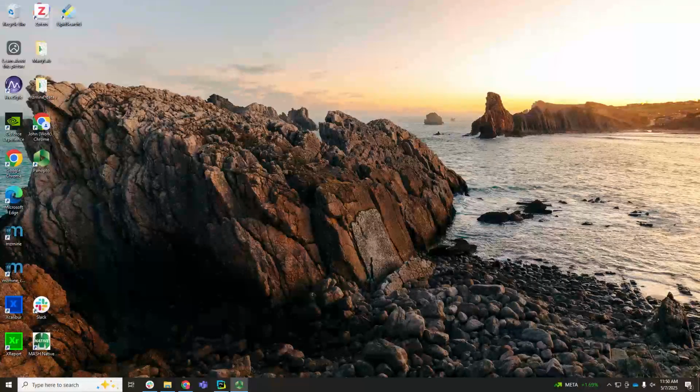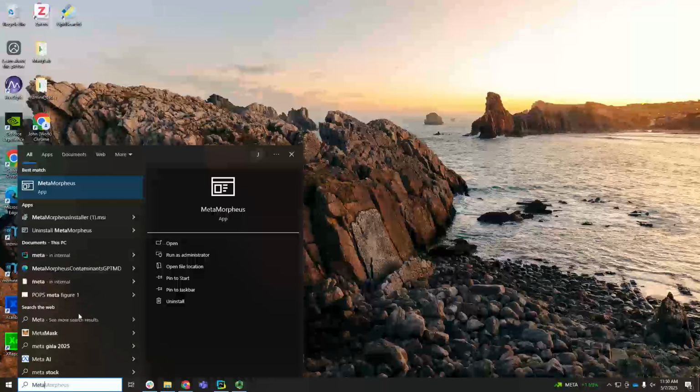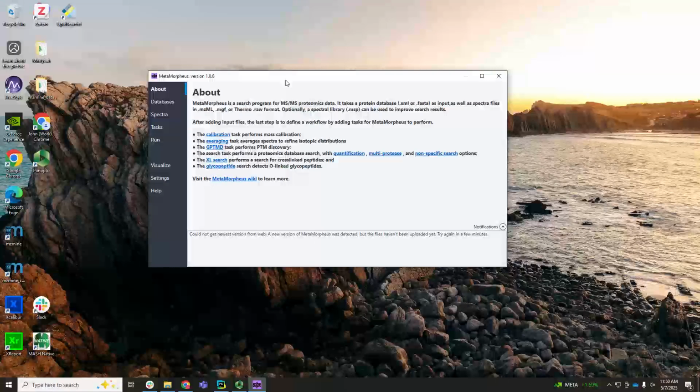I'm a postdoc in the Marty Lab, and today I'm going to be walking you through using IsoDec in the existing MetaMorpheus search engine. So not directly within the IsoDec software suite, but a useful thing to know nonetheless. MetaMorpheus is a proteomics search engine. It does both bottom-up and top-down. And as of a few months ago, it has officially had IsoDec directly incorporated into the workflow as a deconvolution option both for MS1 and MS2 scans.